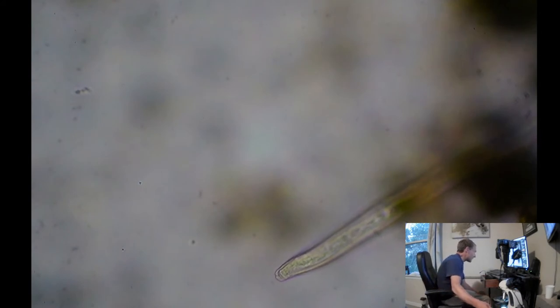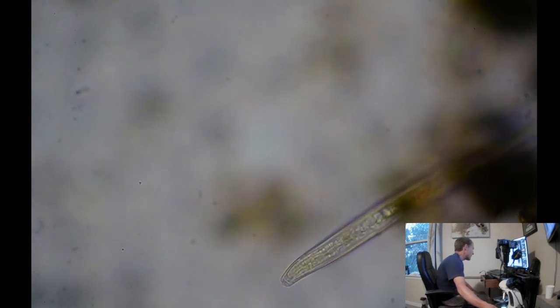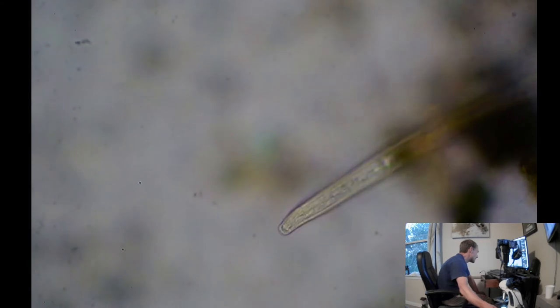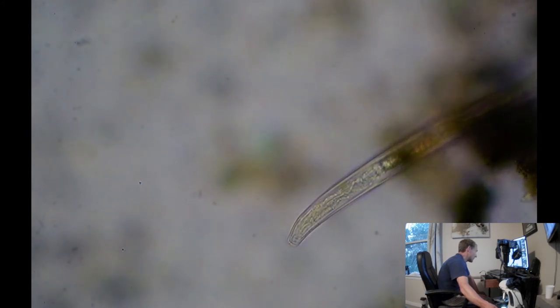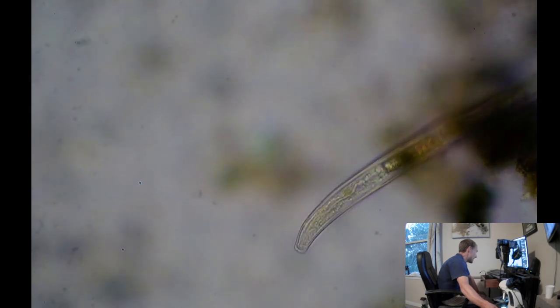But I forget exactly what the nematodes' mouths look like that eat other nematodes. I thought they had more of a mouth looking thing to him. But he's definitely not a root feeder. He's not a fungal feeder, because we don't see any signs of a spike there. He's got a mouth and a throat.